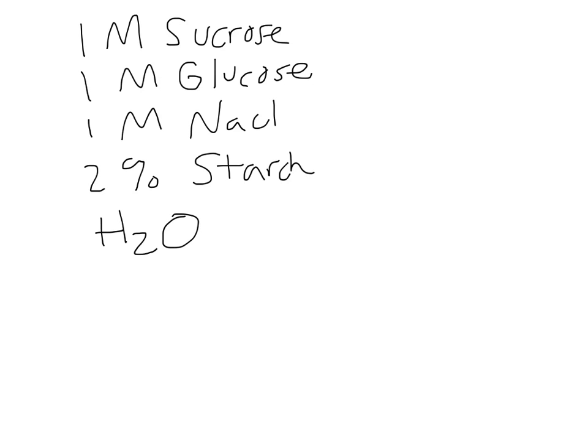What you guys are going to do first is calculate the molecular weight of sucrose, glucose, salt, which is your NaCl, and starch and water. All of that will be in your first data sheet.